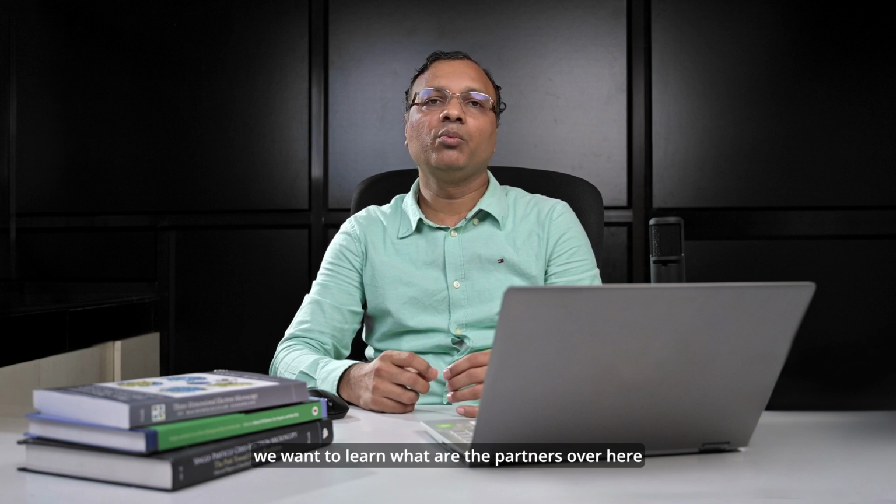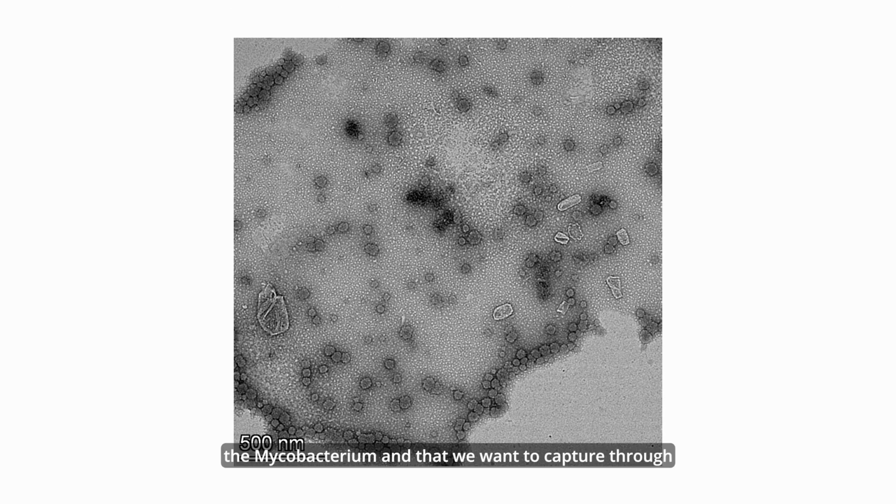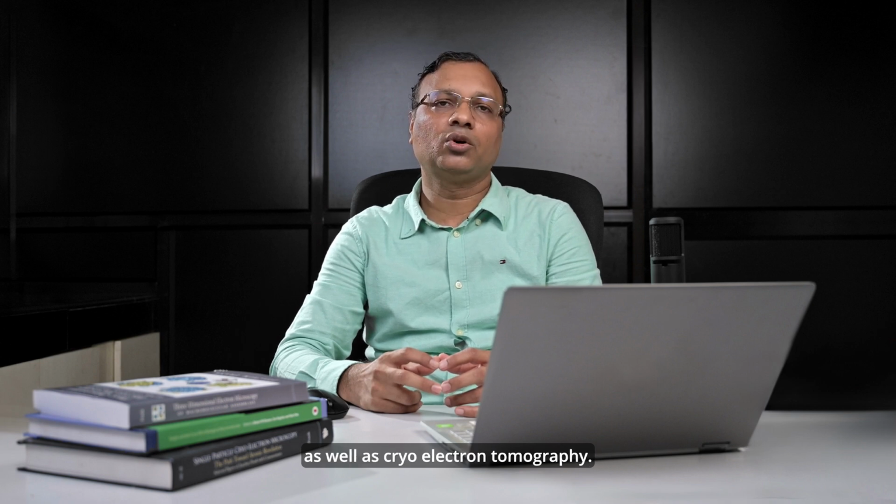In the phage interaction with the mycobacterium, we want to learn what are the partners over here and how exactly the phage is infecting the mycobacterium, and that we want to capture through single particle cryo-electron microscopy as well as cryo-electron tomography.